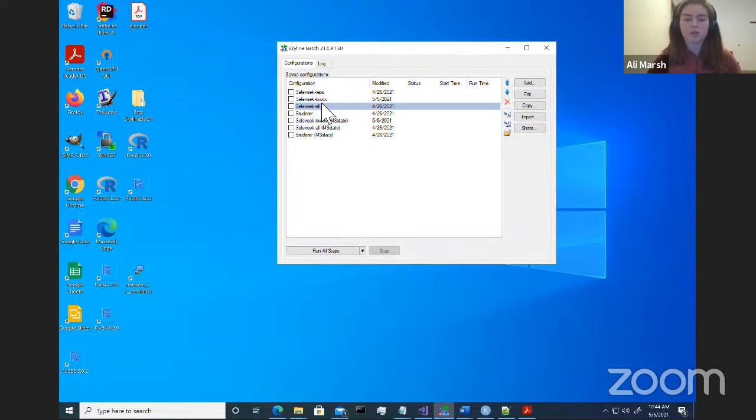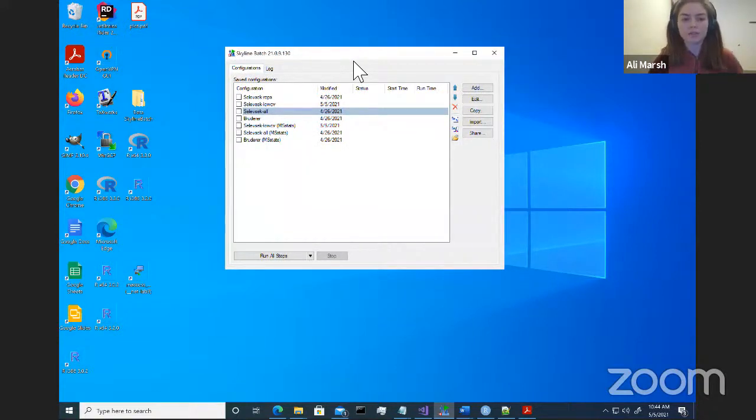If you are one of those people who has a red configuration, I would encourage you to double click on that, and you should see the invalid configuration setup helper, which should guide you through changing the R version back to R 4.0.3. I'll give you guys a second to do that. If you do have any red configurations, you will have to do it for every red configuration, so just work your way down the list there.